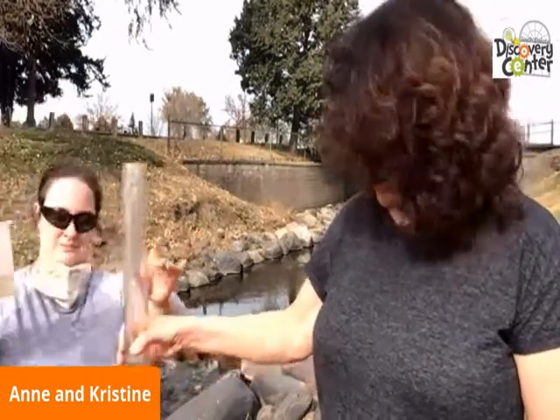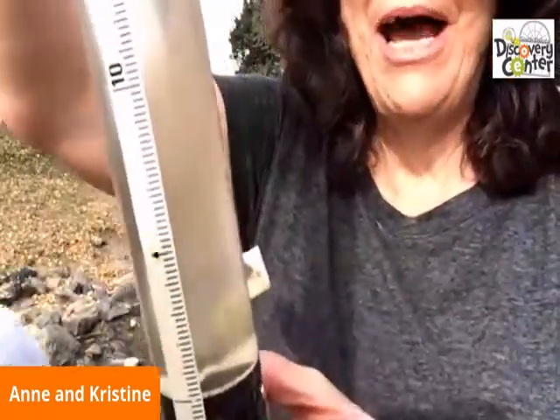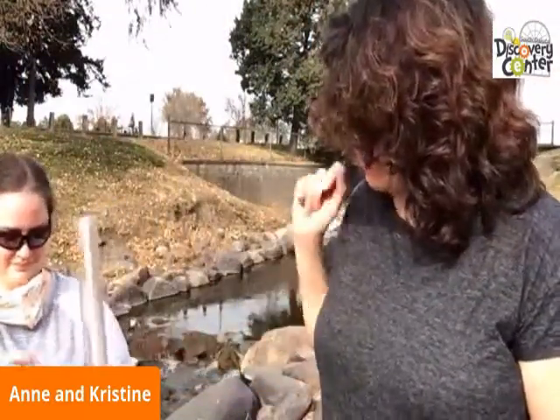Okay, now I just want to show you something. It's pretty easy to see the black and white pattern at the bottom, but I'm going to have Chris hold it, and she's going to turn her back to the sun. She's also going to lift up her sunglasses. The reason I'm going to have her face away with her back towards the sun is because sometimes you will be doing this on a cloudy day. So we want to make sure all of our T-tube readings are not influenced by the sun. So Chris, I want you to look down that tube. Can you see the black and white pattern on the bottom?